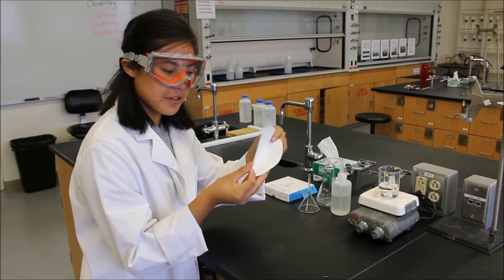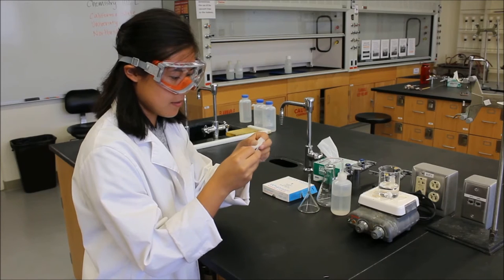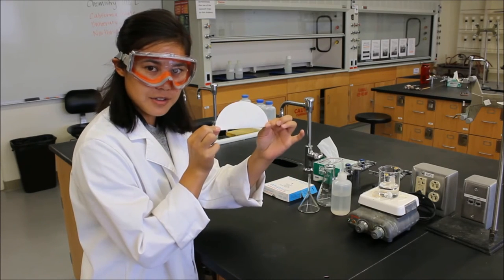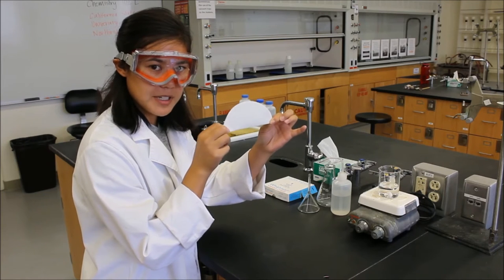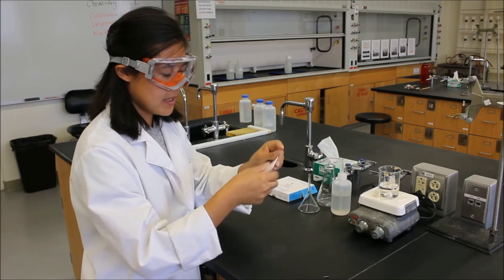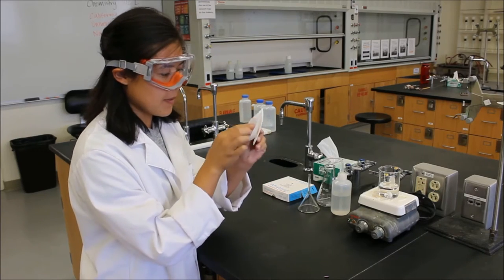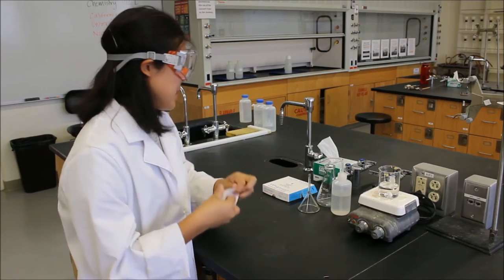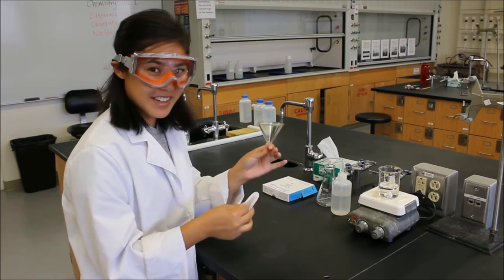And to fold it, we're going to fold it in half. So that makes a little half circle. We're going to fold it in half one more time to make a little quarter circle. Now that we have this, we just open one of these pockets. And we put it into our funnel.